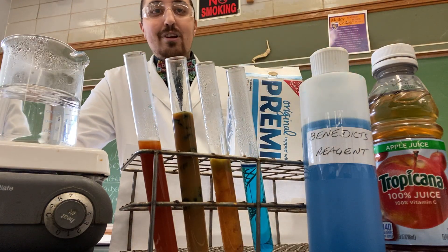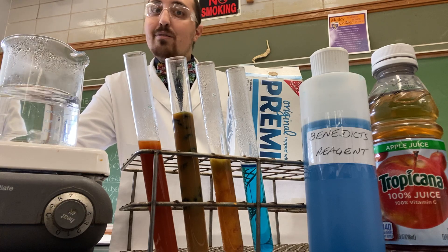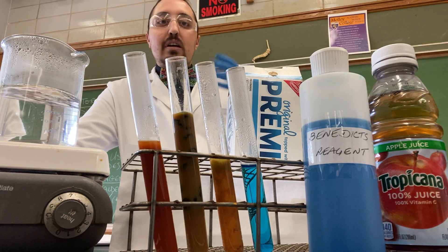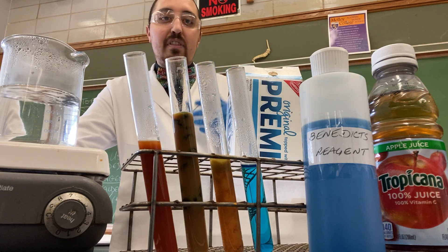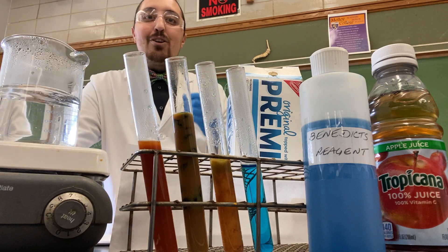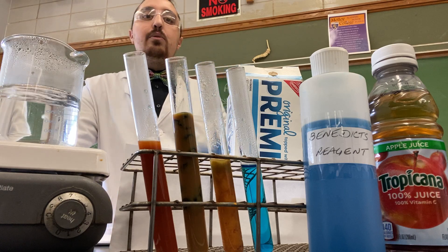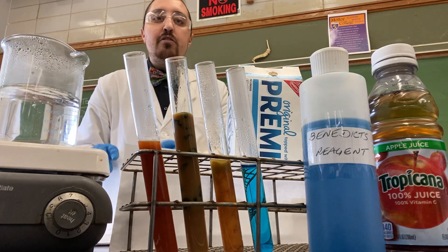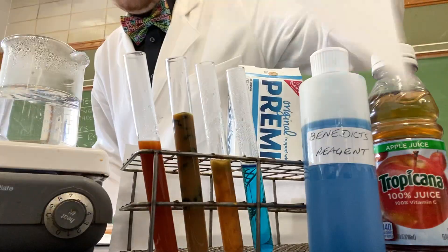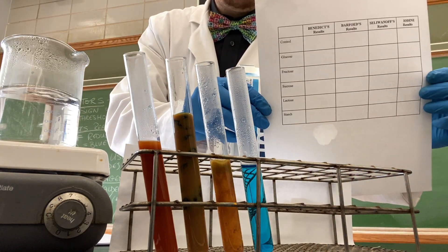Remember, Benedict solution is the test for reducing sugars. Now that we're all done and we've looked at our different indicators and different foods, you're ready to collect your thoughts. Make sure to write your observations on your data sheet and follow along as we do the lab together. Make sure to also fill in the table that you can find in your lab manual.